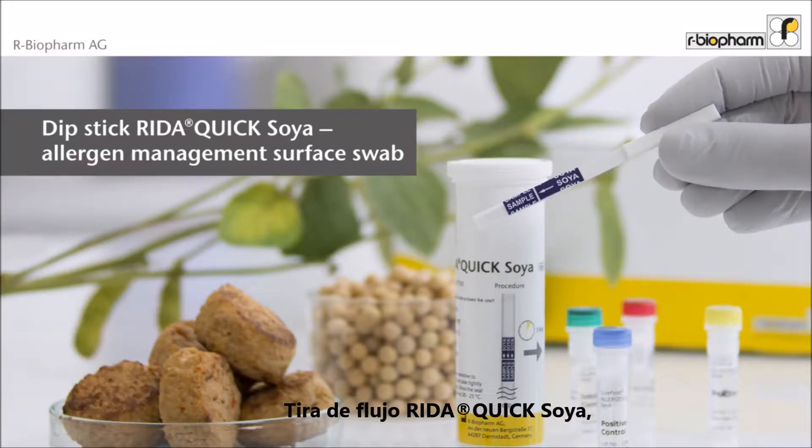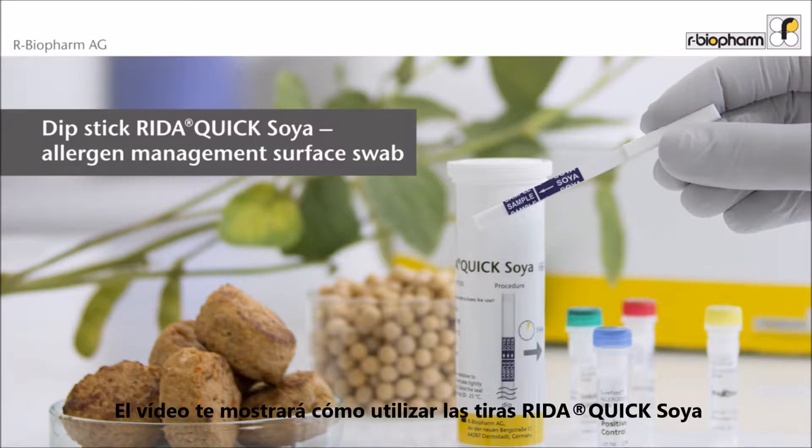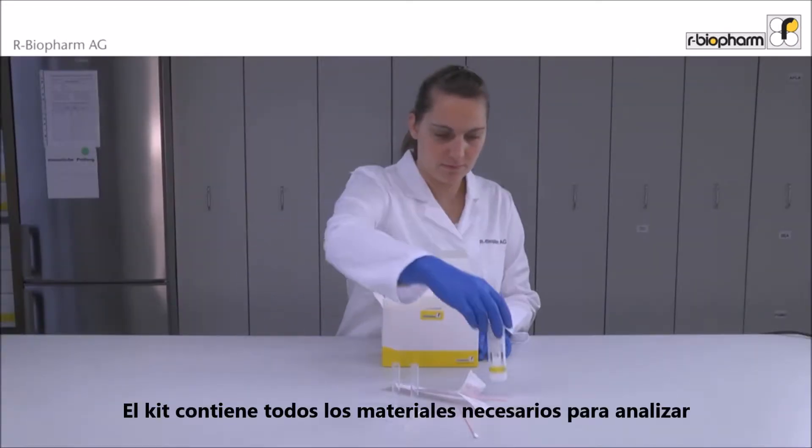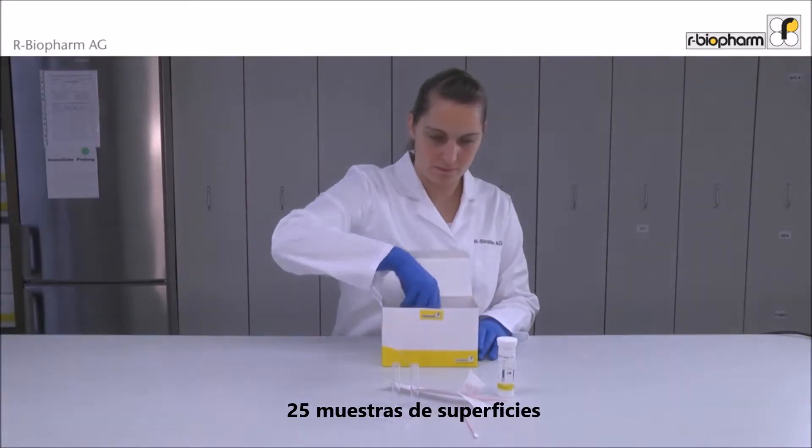This video shows you how to use the RIDA QUICK Soya dipstick for allergen management analysis of surfaces and food samples. The test kit contains all material needed for the analysis of 25 surface swabs.